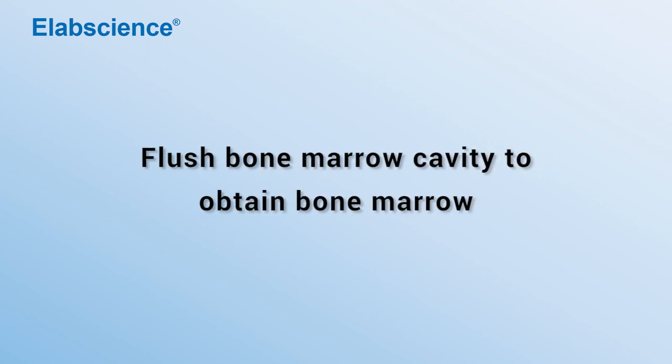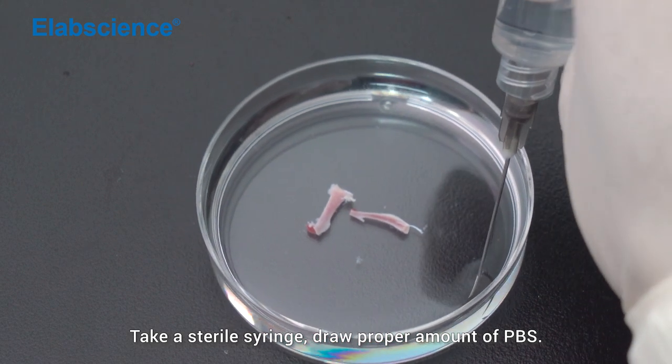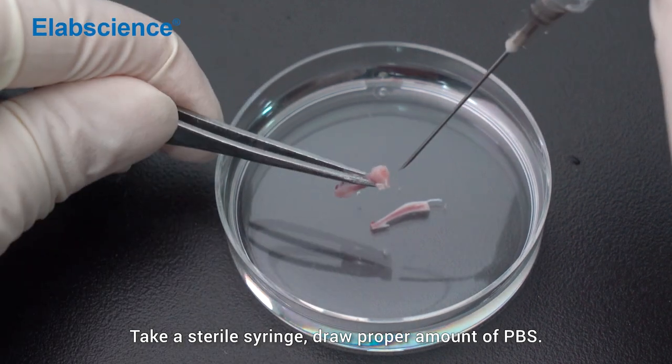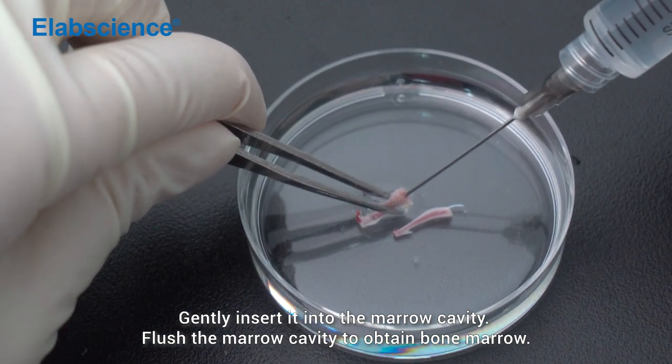Flush the bone marrow cavity to obtain bone marrow. Take a sterile syringe and draw a proper amount of PBS. Gently insert it into the marrow cavity and flush the marrow cavity to obtain bone marrow.